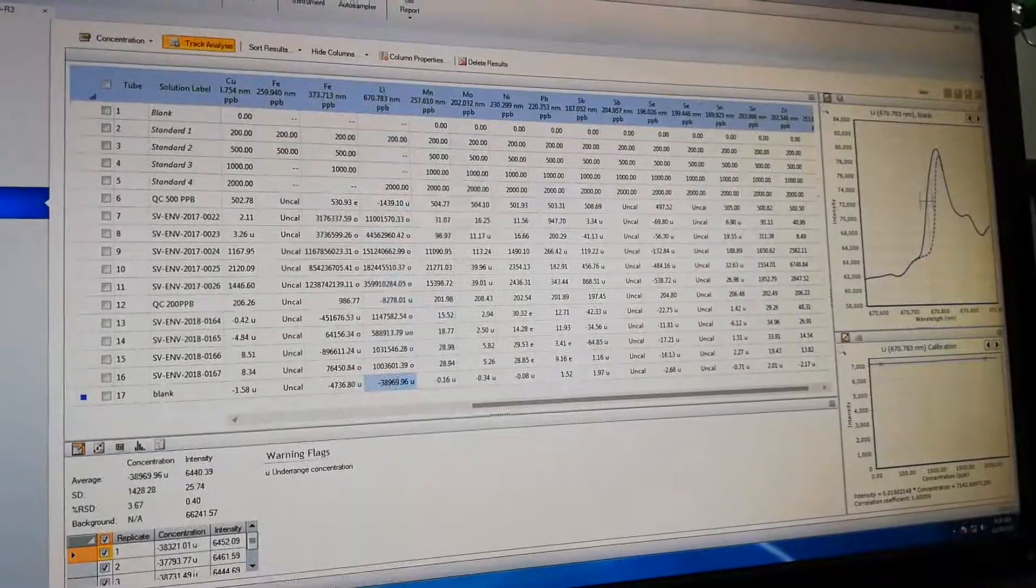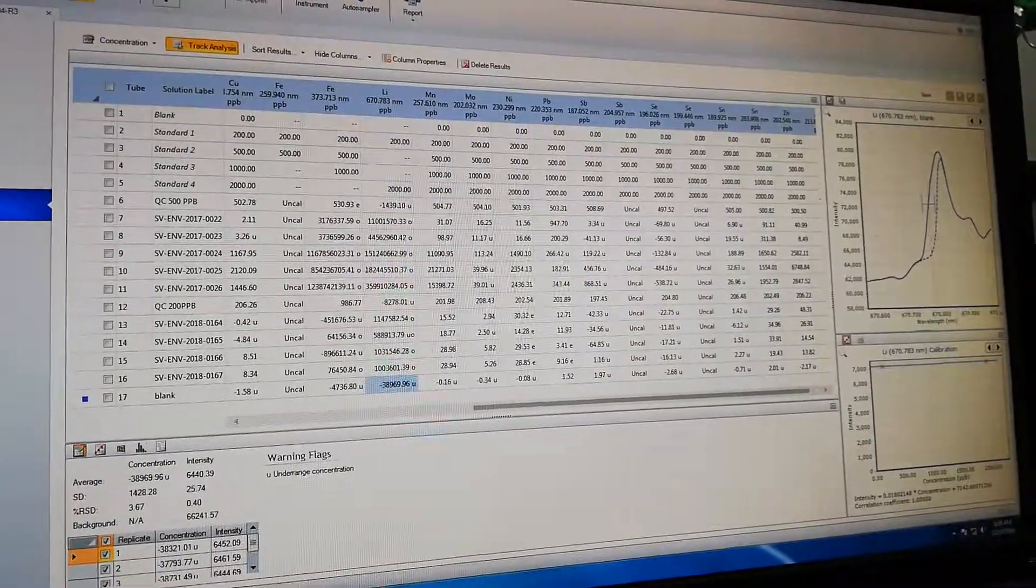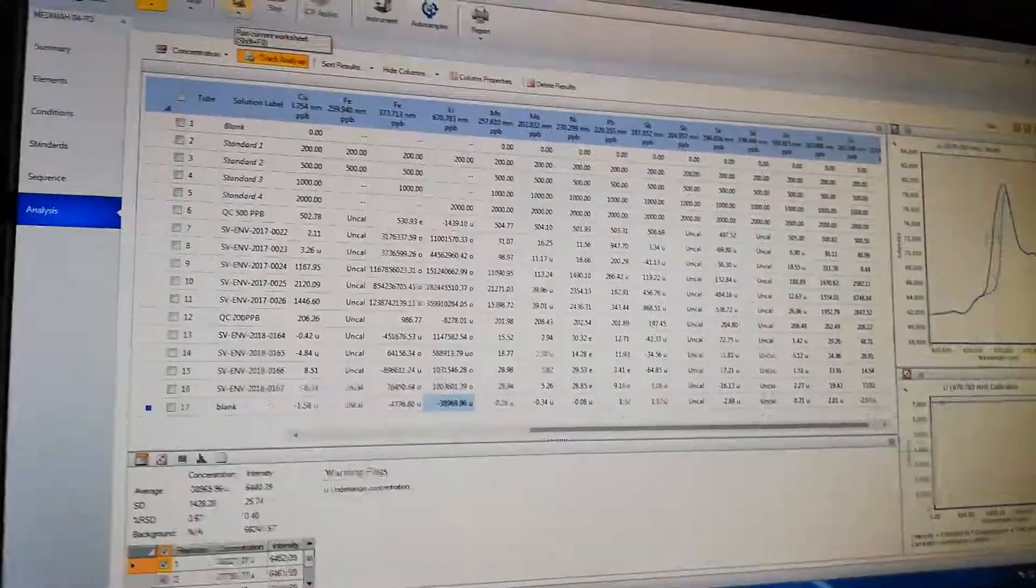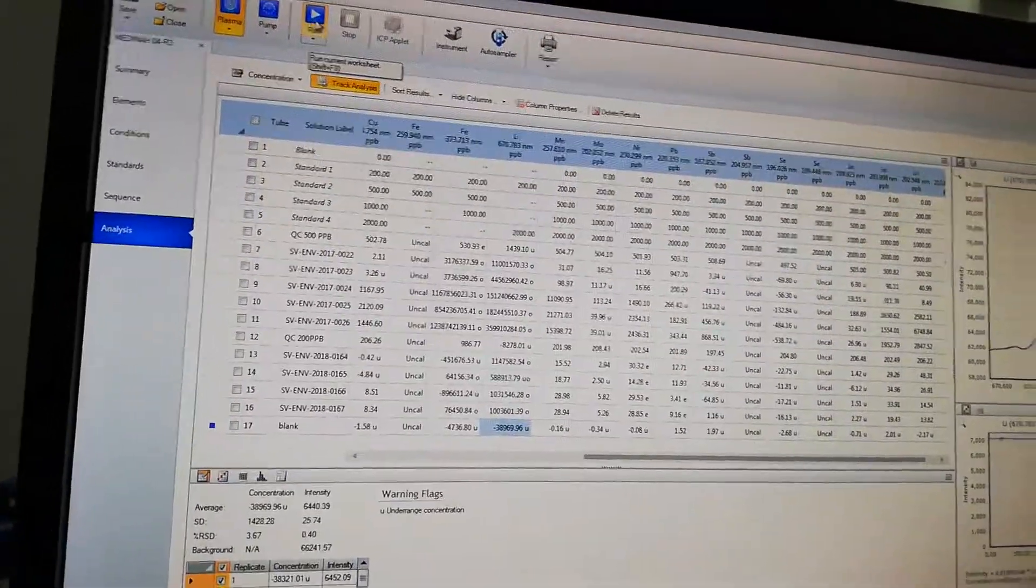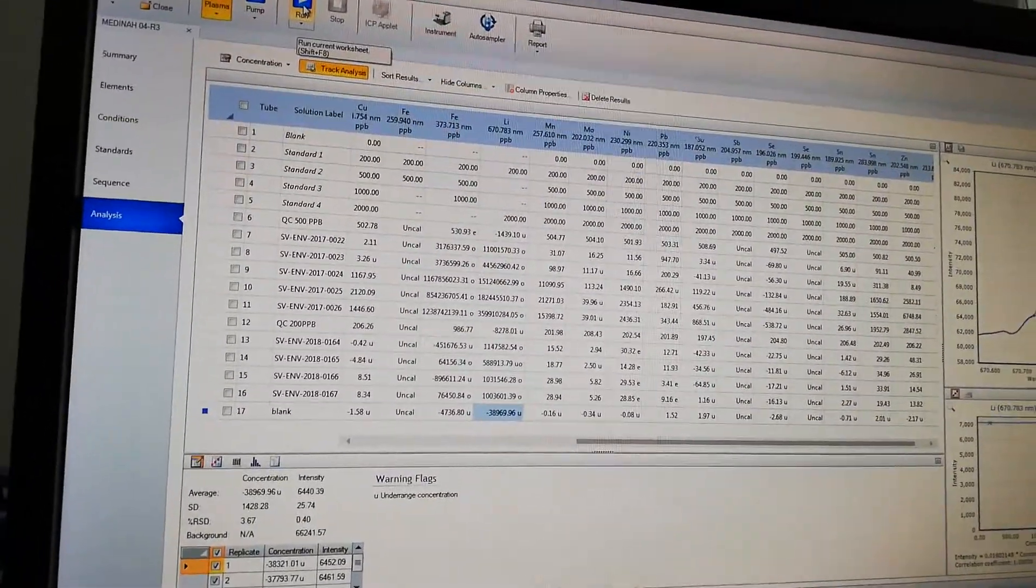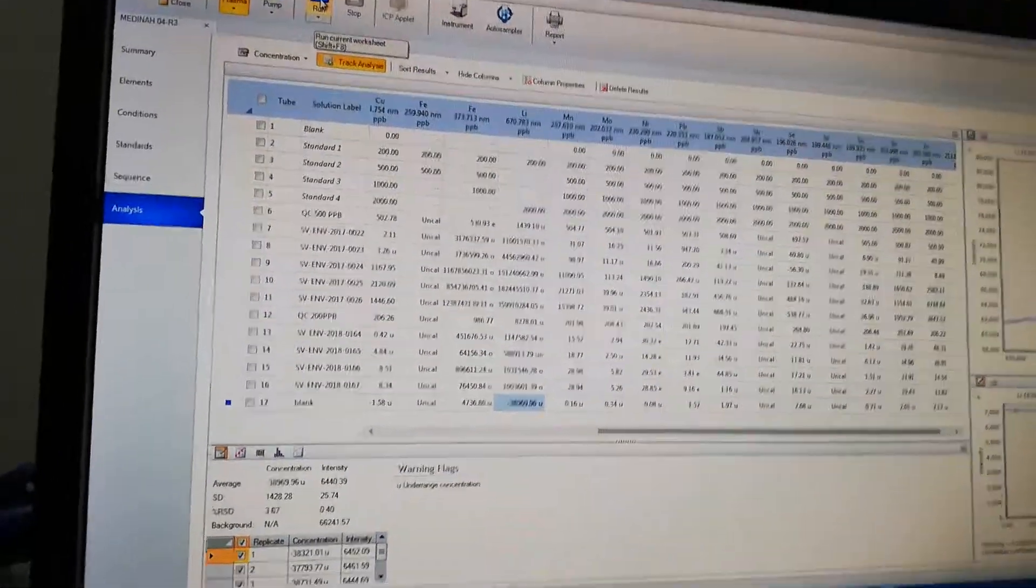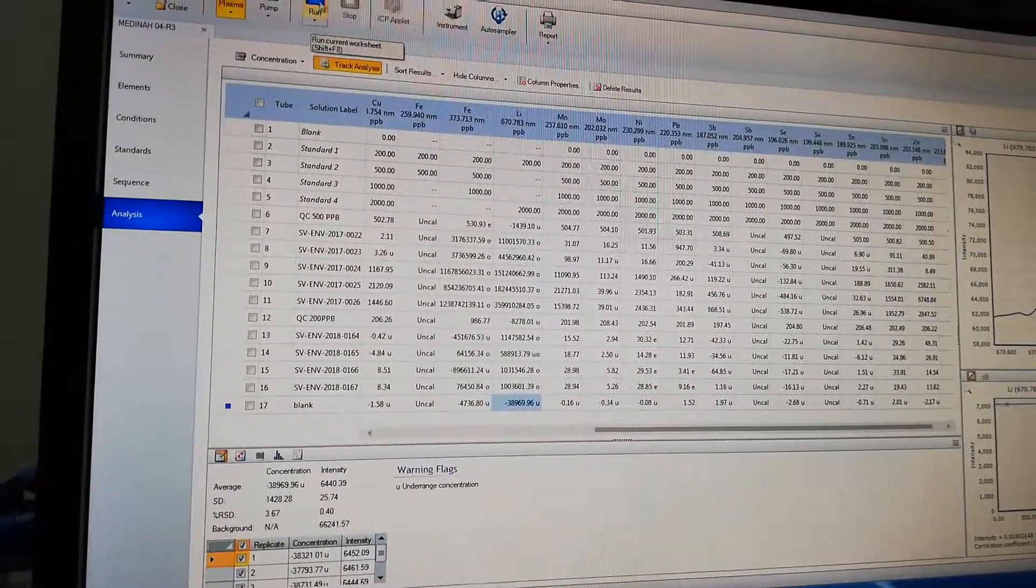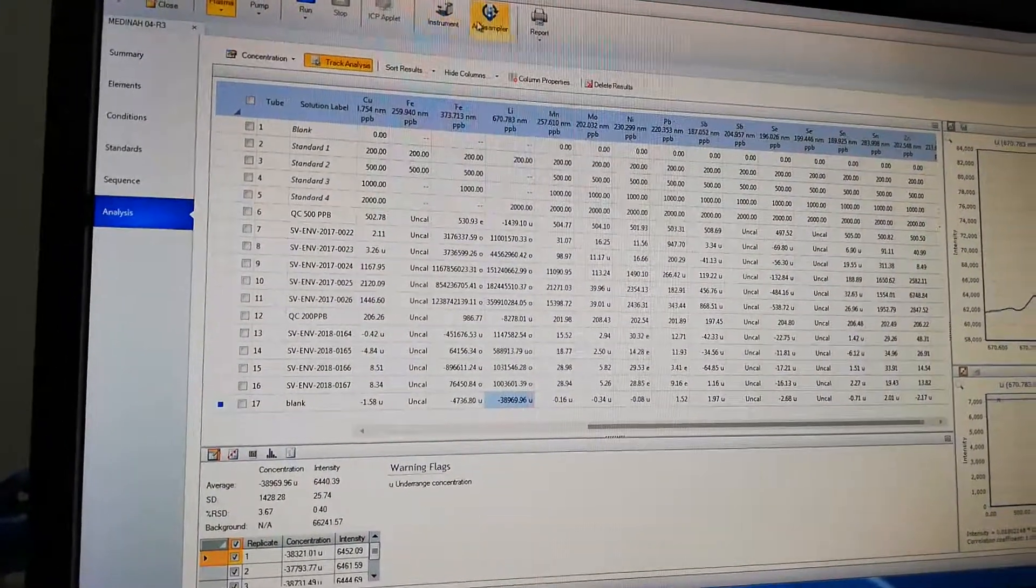Once you finish all settings, go to analysis and run the sample. This is very easy operation of this machine.